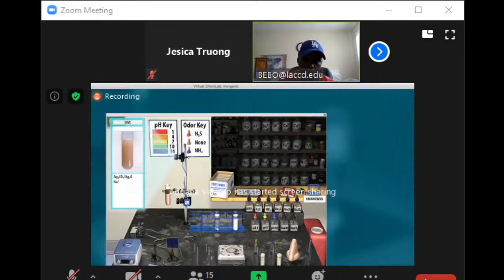And what is telling you there, it says silver oxide. So it's telling you that sometimes the silver nitrate could also decompose into silver oxide and silver carbonate, but what we are expecting in this reaction is the silver carbonate and the sodium nitrate, which will be in the liquid form.